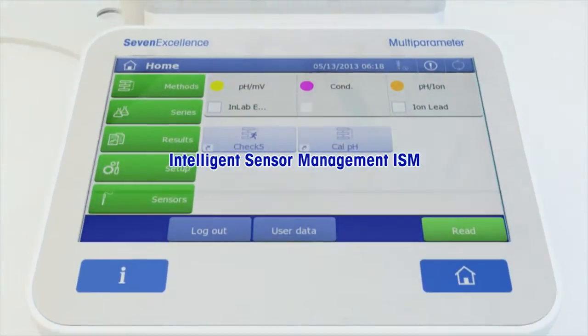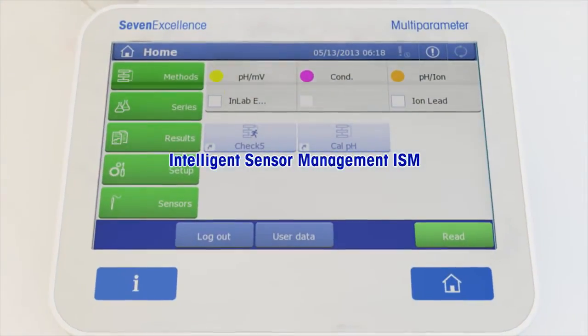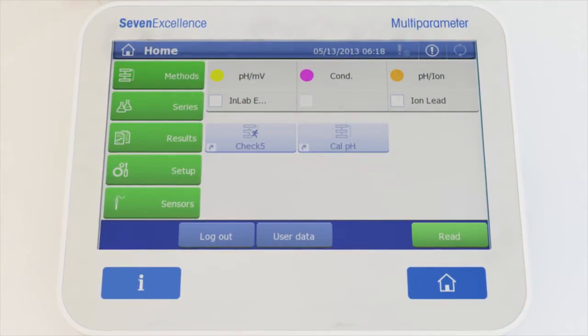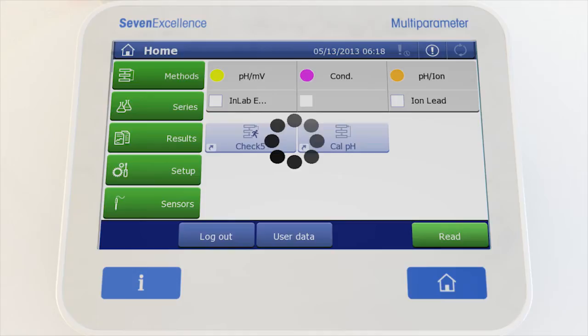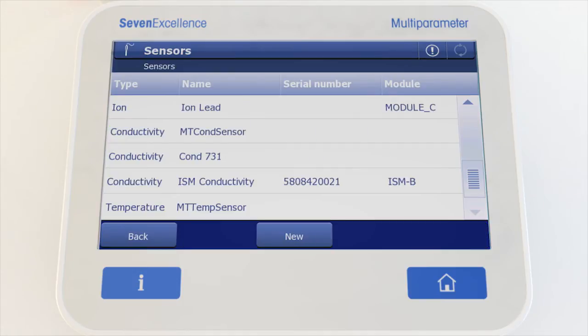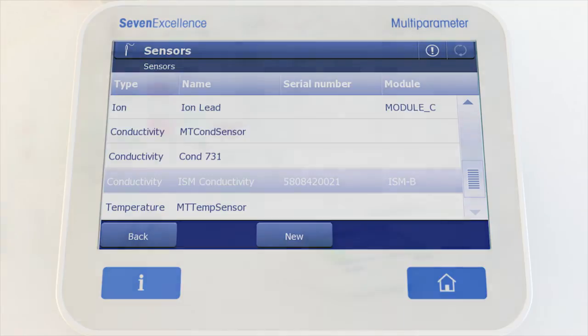Thanks to intelligent sensor management, ISM, your sensor is immediately recognized by serial number and sensor ID. Avoid mistakes by only using the latest calibration data.